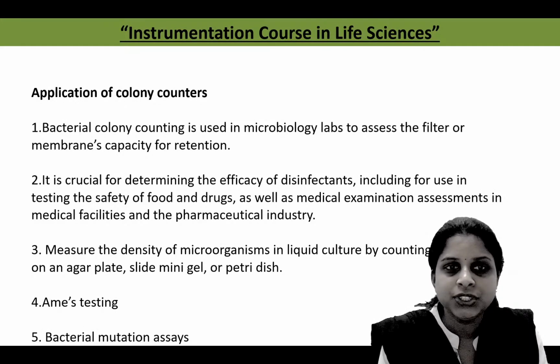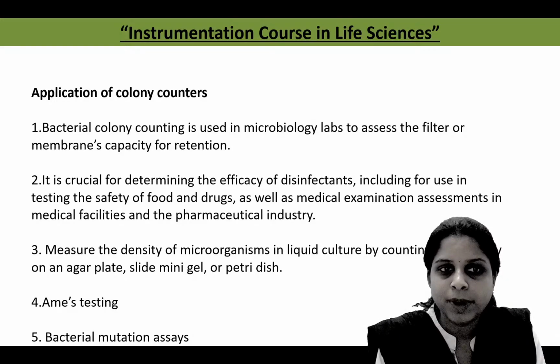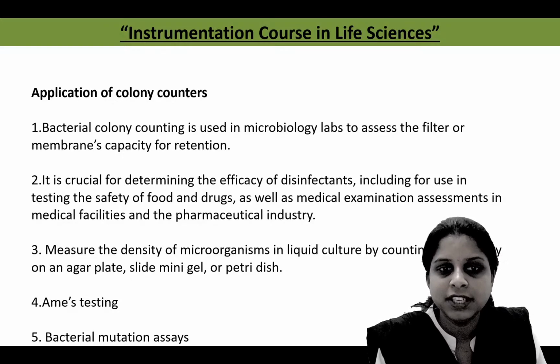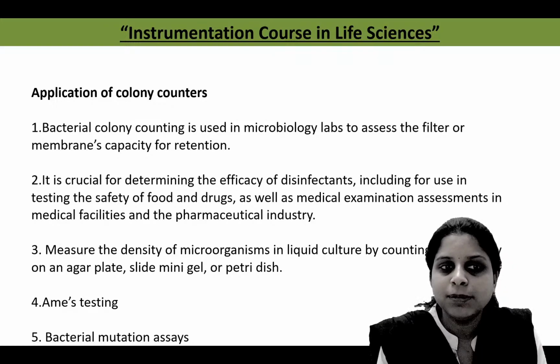There are some applications of colony counter. First, it is very useful in a microbiology lab to count the colonies present on a filter or membrane, which can determine the capacity of retention. It is crucial for determining the efficiency of disinfectant, meaning it is used in sterility testing or safety of food and drug, in medical examination assessment or in the pharmaceutical industry. It measures the density of microorganisms in an agar plate, slide, mini gel or in a Petri dish.